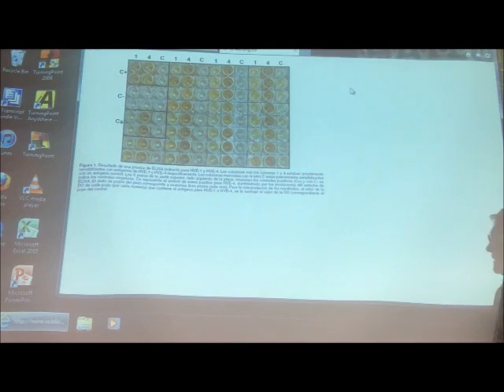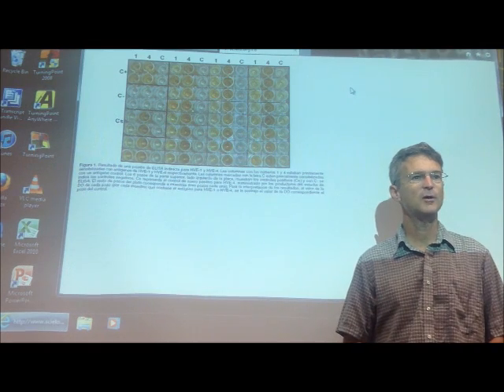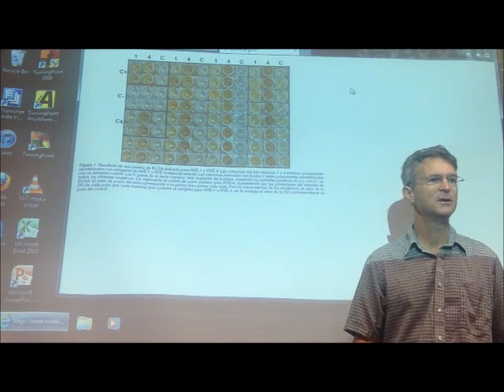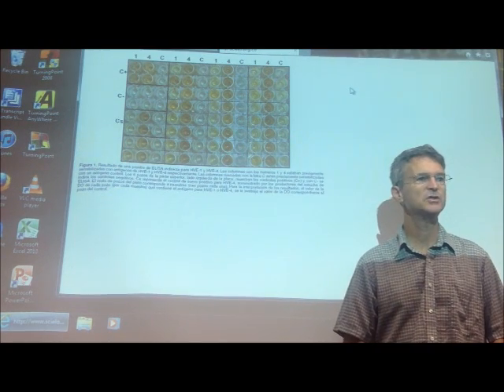And so you can mark the plate any way you want with a Sharpie so that you can mark off different things. You usually want to have a control portion where you have nothing in there, no antigen at all. You'll have control portions where you'll have no antigen and no substrate and so forth, and you have all those controls, and that'll be the background that you zero the machine to.